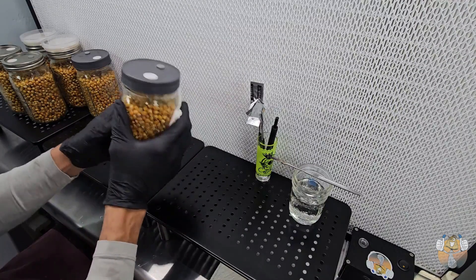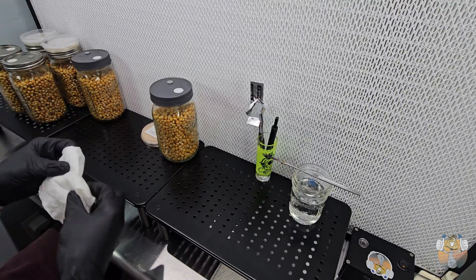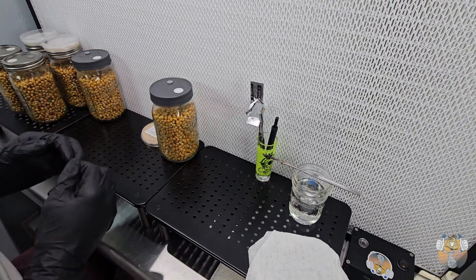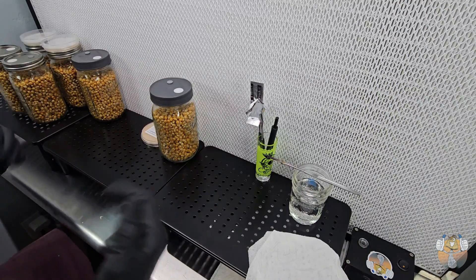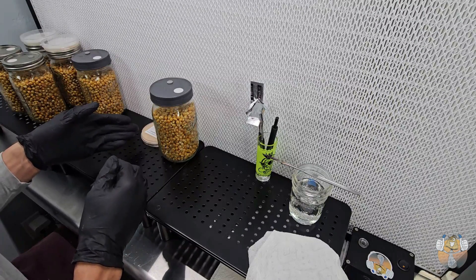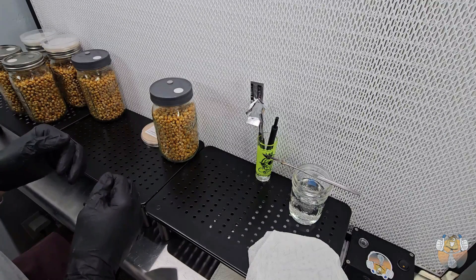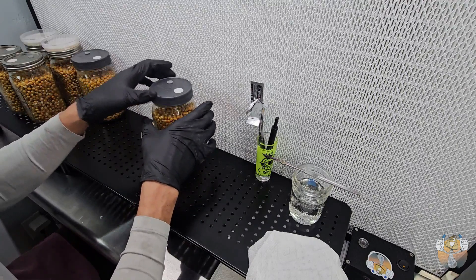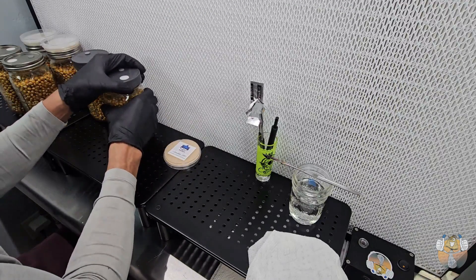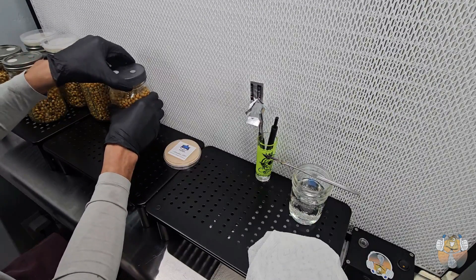I've got three sets of genetics and I'm going to do two popcorn inoculations with each — two popcorn jars each. So we'll have a total of six today. Once I'm done with that I'm going to do some agar transfers on our pre-made agar dishes. Let's crack that open and get going.